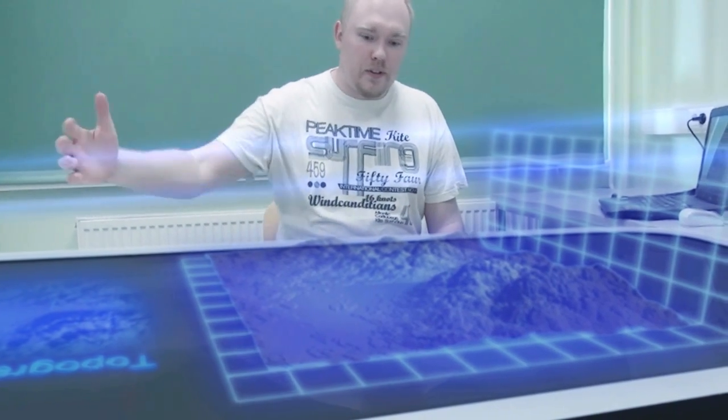This method allows to obtain three-dimensional images of the studied surfaces, as each pixel also has a height coordinate.